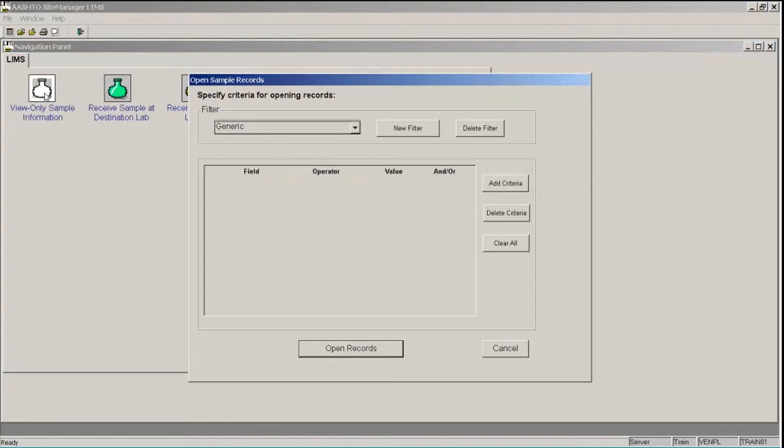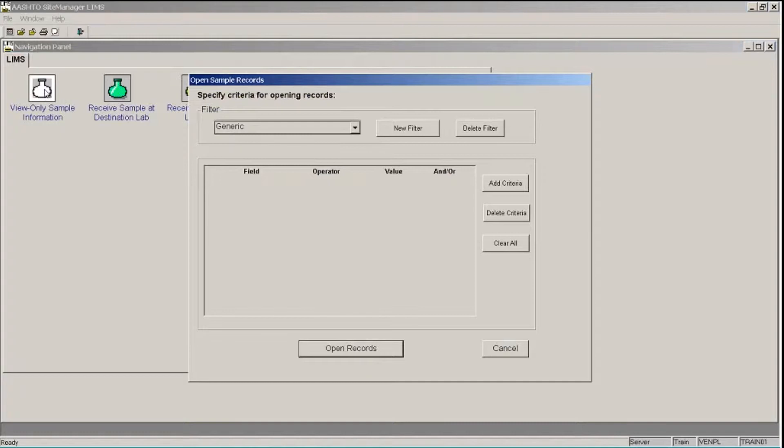You can specify generic criteria each time you want to look for a sample record, or you can specify and save filters if you use the same search criteria on a regular basis. So first, let's define a generic filter.